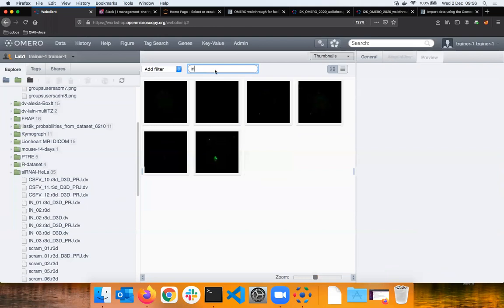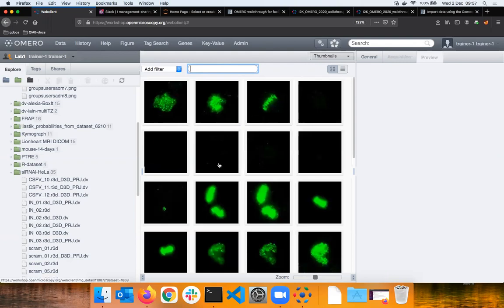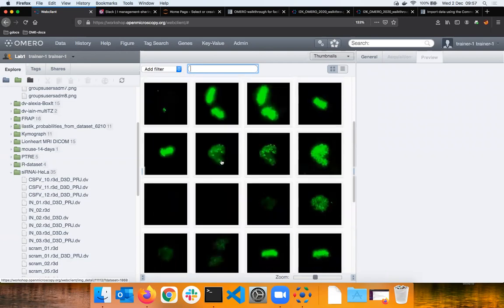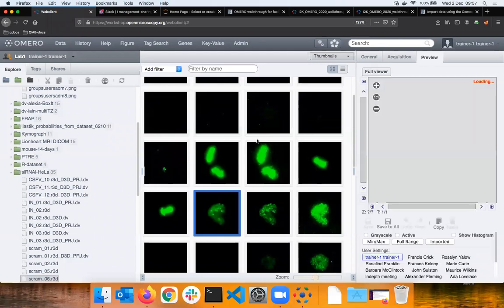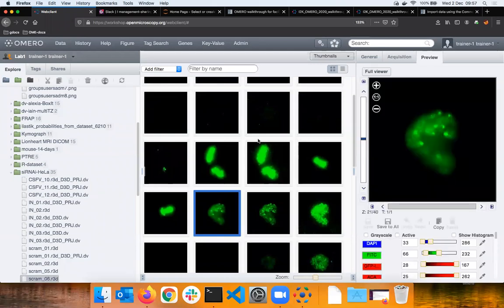And if I go for in, you can see that the control indeed is not stained. So this looks very good. And in this simple manner, if I remove the filtering by deleting the text, I can see that my staining really worked, and I needed very little time to verify that. Okay, what if I again select the image I was on before and think further?